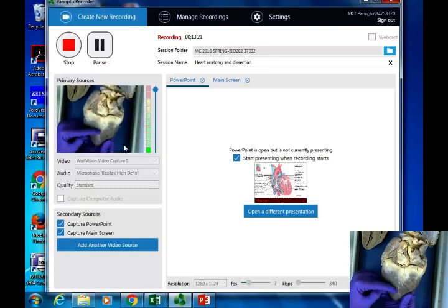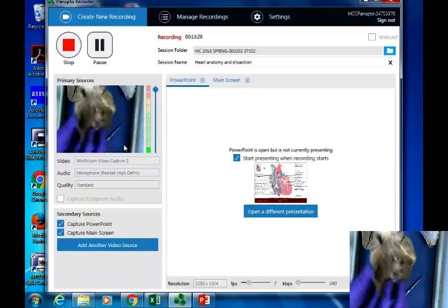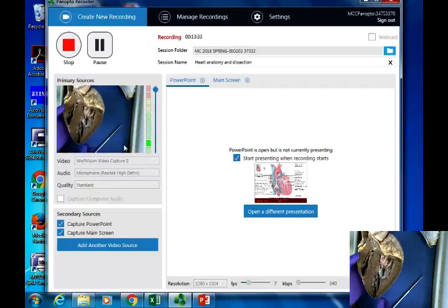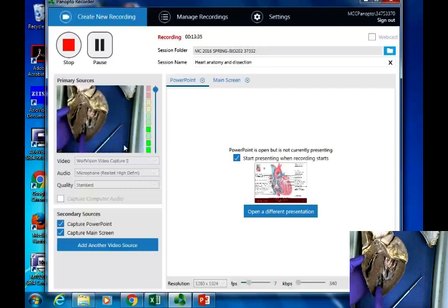This is going to be either the posterior interventricular artery, likely, or it could be that middle cardiac vein. But it's likely the artery right there. So again, we use the orientation inside to figure out what we're seeing outside, as well as other parts. So here's some trabeculae carneae. There's some very good papillary muscles there and there.